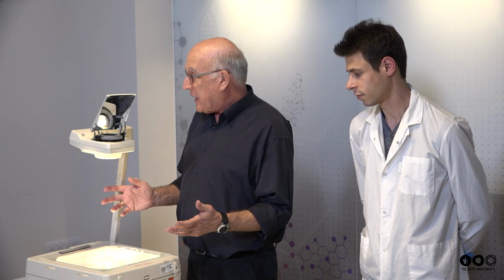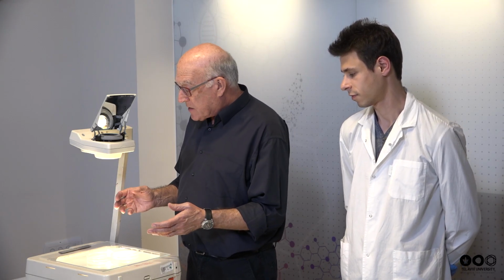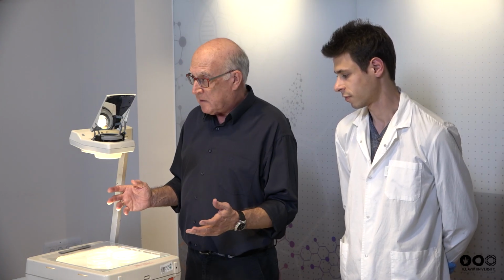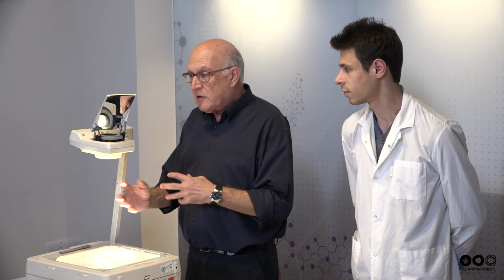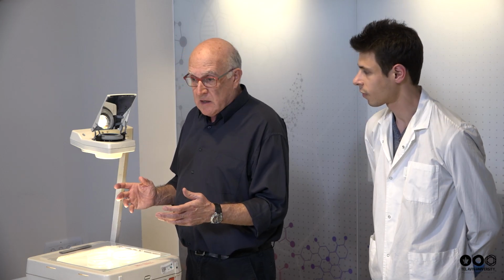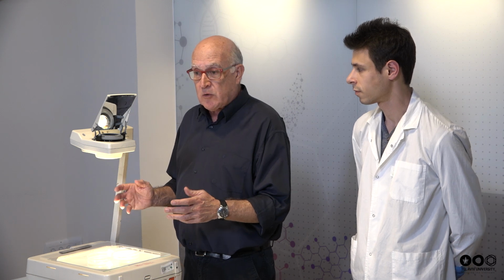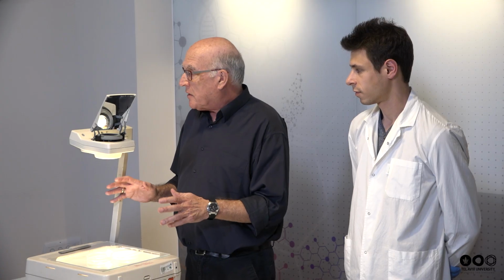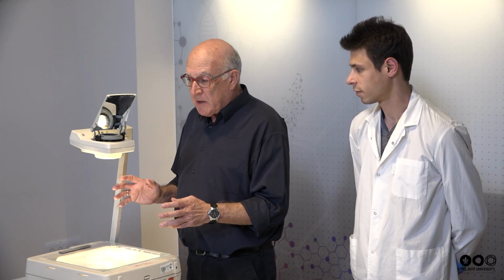Maybe it's cytoplasm. Well, cytoplasm maybe, but obviously a very large molecule, very hydrophilic, and in some fashion interacting with the water around. And this is what makes viscosity. Now, if we propose a hypothesis and say that if it's now in solution in a hydrophilic milieu, in an environment, if we make that environment a little more hydrophobic, maybe this mysterious material will crash out.